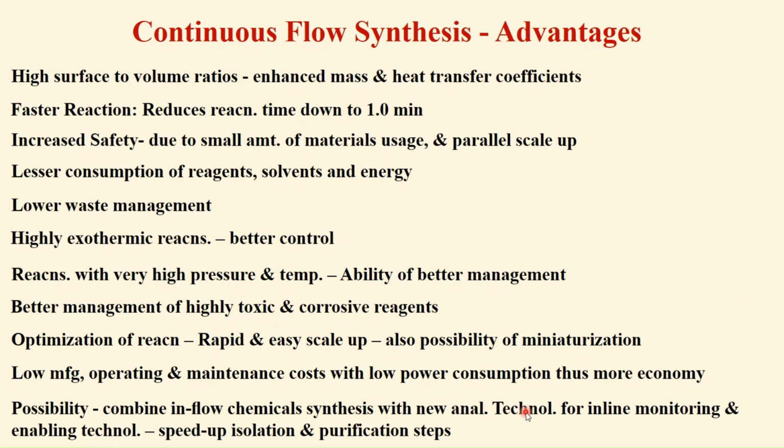It offers the possibility of combining inflow chemical synthesis along with new analytical technologies like LCMS or GCMS and whatnot. And that's why inline monitoring is also enabled. Thus, it speeds up the isolation and the purification of the chemical intermediates during the synthesis of APIs. Though it has many advantages, it has its own limitations too.